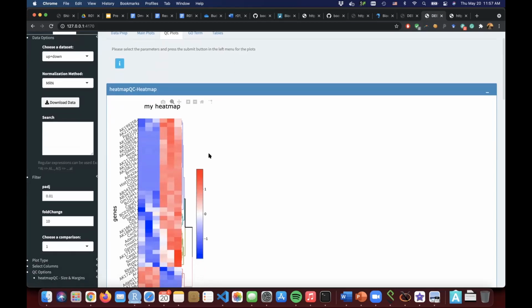make a mistake, because, for example, if it is 0 here and the read counts are 10 here, when you add a pseudo count like 0.1, it's going to be 0.1 in one condition average, and the other is going to be 10.1. And when you divide, it's going to be like 100-fold change. So you don't want to do that. So DESeq2 handles that for you, and I'm using DESeq2 fold changes. Limma and edgeR are doing that too. So they all have their own fold change calculations.